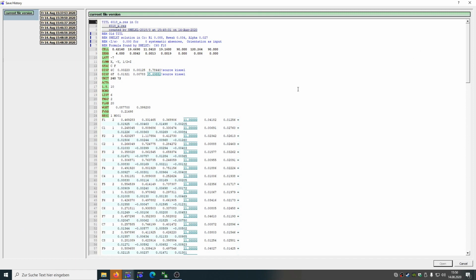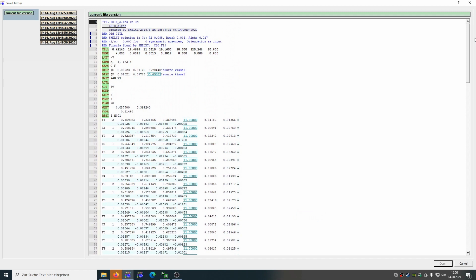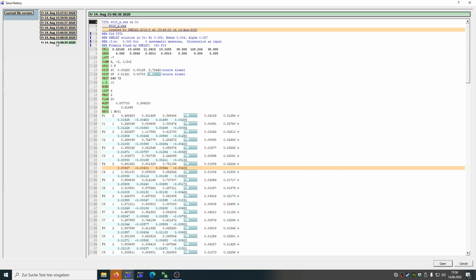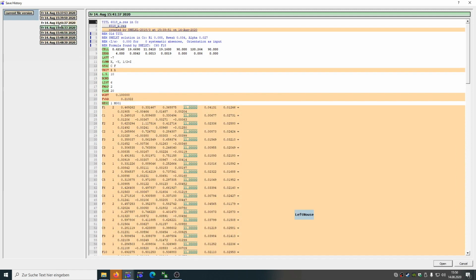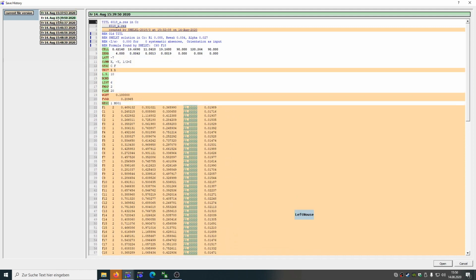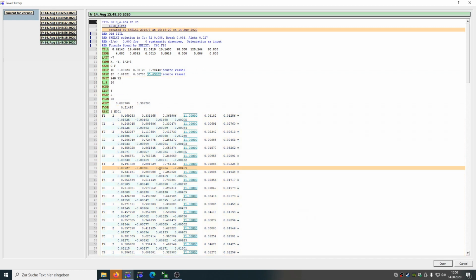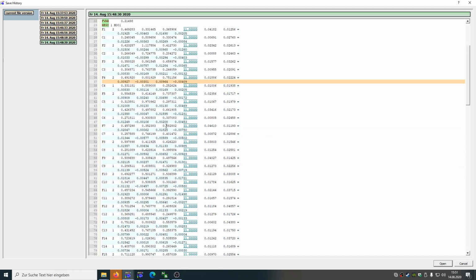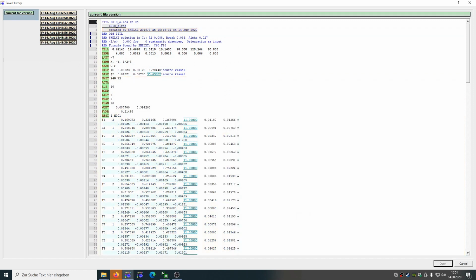You have here your editor in the same color scheme as you see in the normal editor, and additionally here are some buttons with dates when this file was saved, and you see then in orange what has changed to the current version. So I think that's rather convenient, hopefully.